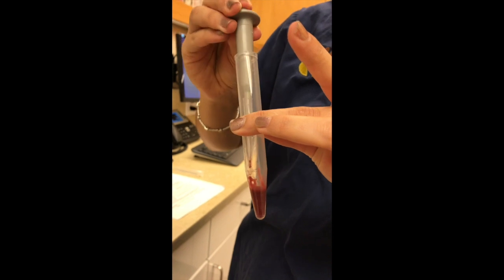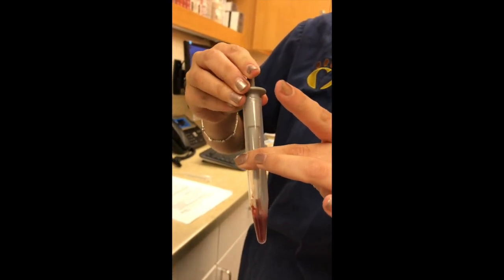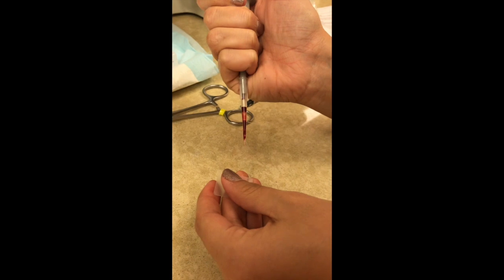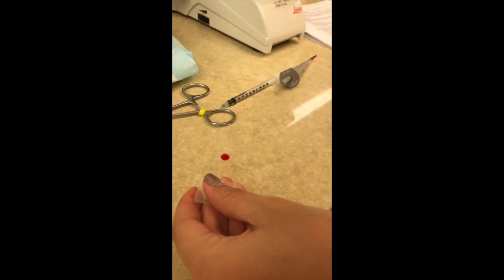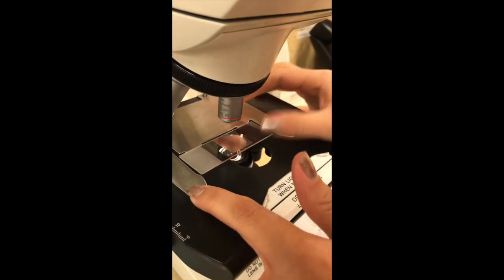Great, and I will take 1 drop of my solution. I'm going to put it on our slide. Apply a cover slip, just like that. And then I can take a look under the microscope for microfilaria.